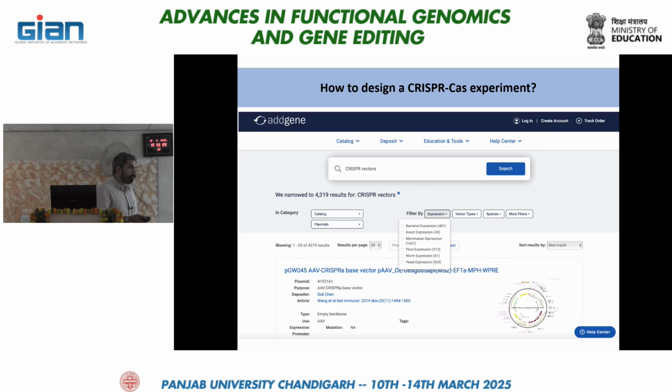If you are working on a plant expression system, then you can select plant expression here, and you can see 213 vectors available from which you can choose. Similarly for bacterial expression, we have 401 vectors, and for insect and mammalian expression, we also have vectors. You can tweak these parameters and easily get the vector which you are looking for.